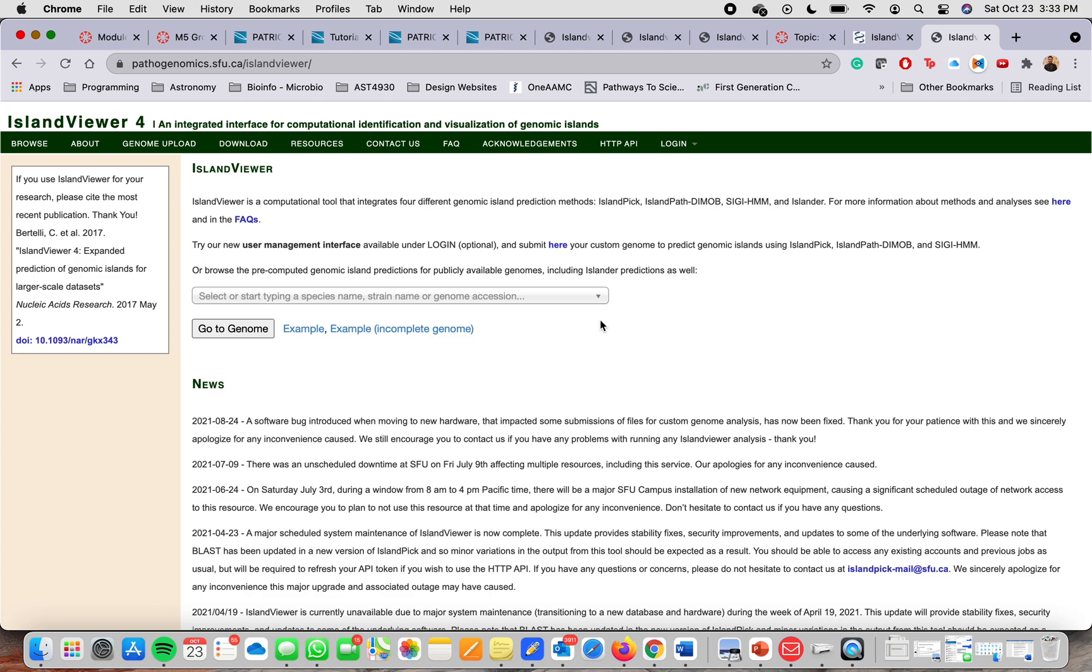Genomic Island, if you haven't heard from the term before, it is a part of a genome that has evidence of horizontal origins.